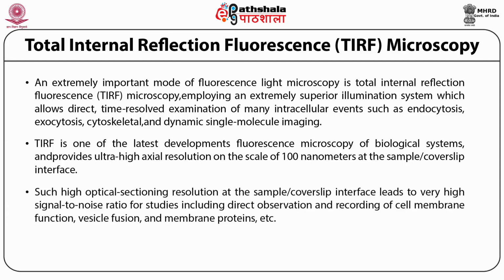Such high optical sectioning resolution at the sample or cover slip interface leads to very high signal to noise ratio for studies including direct observation and recording of cell membrane function, vesicle fusion, and membrane proteins, etc.